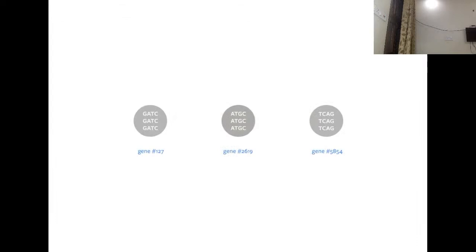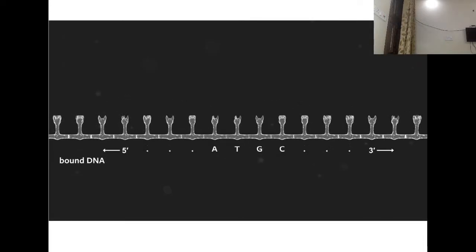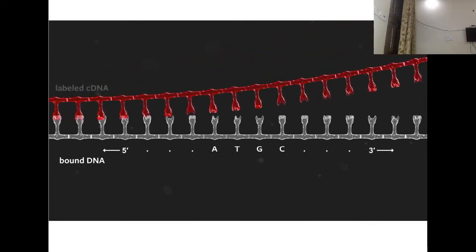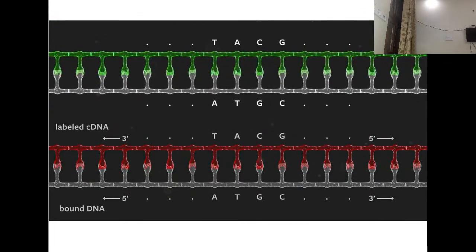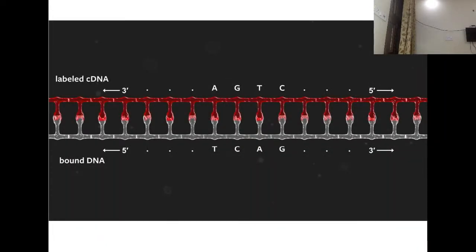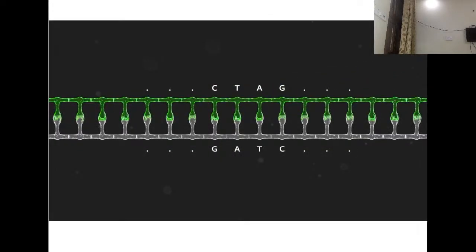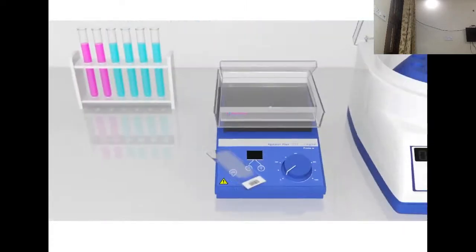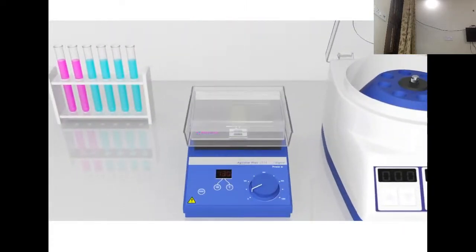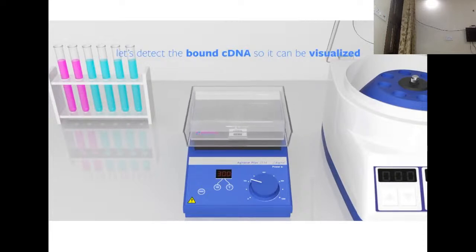For the sake of our example, we'll zoom in and show that some of the labeled cDNA have bound to the DNA in the spots and formed base pairings. Here we see green and red cDNA bound to this spot. Only red cDNA is bound to this spot. And only green cDNA is bound to this other spot. In a real experiment, you would not see any of this detail. You would only see the original microarray. Now we must wash off the unbound cDNA to see what is bound to the microarray. Let's detect the bound cDNA so it can be visualized.